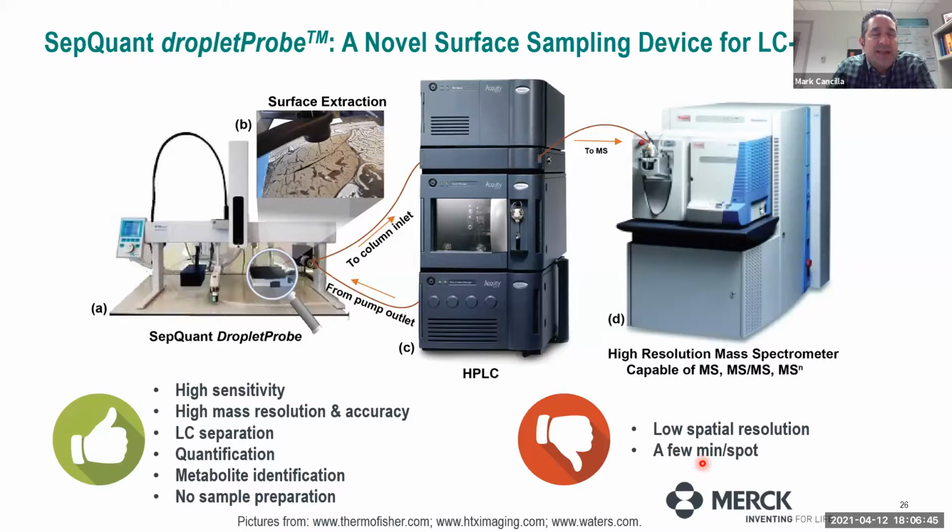We did a head-to-head MALDI versus nano-DESI, and the MALDI was still just a little too energetic, even with a lot of method development, dissociating some of these labile phase 2 type metabolites, where the nano-DESI was able to pick it up. So that's the paper that we're working on now. Is this with Julia Laskin or Graham Cooks? Yes, Julia Laskin. Okay, thank you.